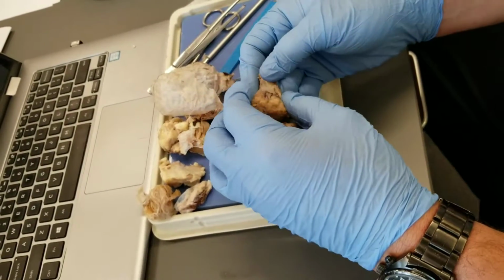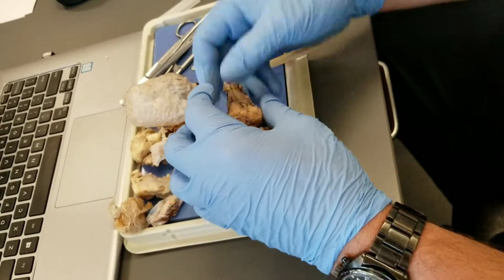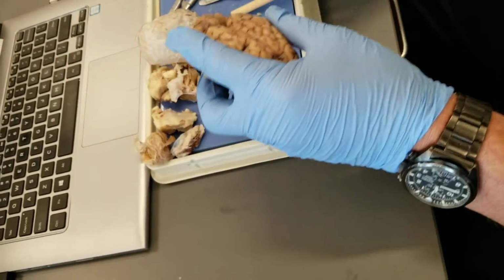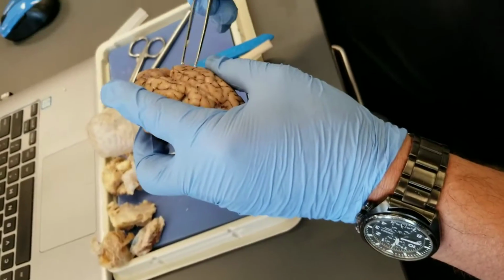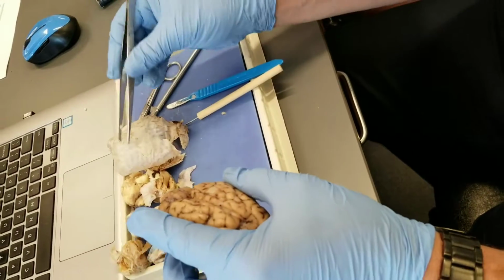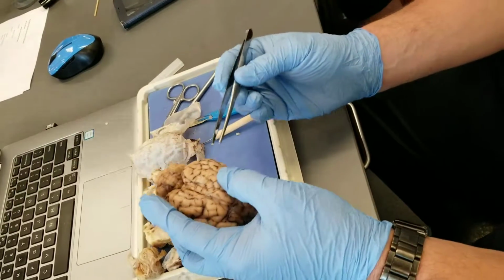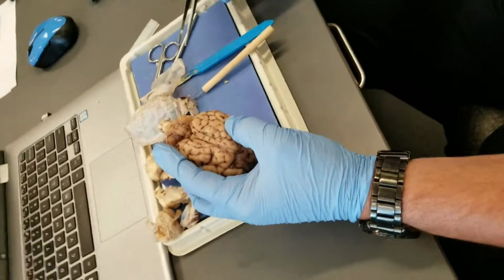And then for the cerebellum back here, and again, you've got to get that wispy arachnoid stuff out of the way. When you're taking that off, the pia mater, is the pia under that? No, the pia is actually this glistening layer right on the surface. What I'm getting a hold of, well, I just punched through. That's the pia there. Real thin stuff. So this is the dura. And the arachnoid is on that? So the dura is on top. Go beneath that, and the arachnoid is the wispy stuff that I've been tearing through here. And then the pia is a much denser wrap that's right on the surface of the tissue. Those are your three layers. And the spaces are in between all the layers.